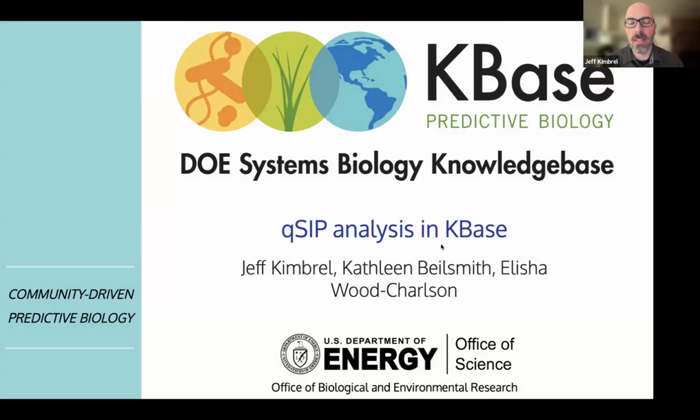Yeah, so Kathleen and I today are going to talk about qSIP analysis, kind of broadly speaking, and then how we have chosen to do a first pass incorporation into KBase, and this is where we're looking forward to some community feedback about the best way that would make it the most useful to users.